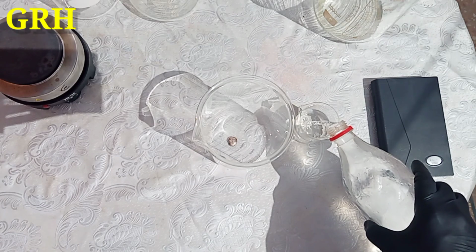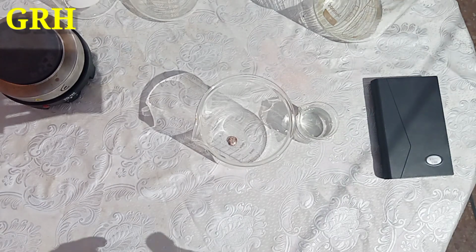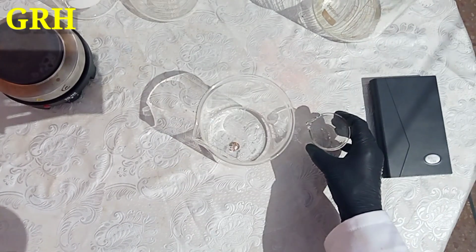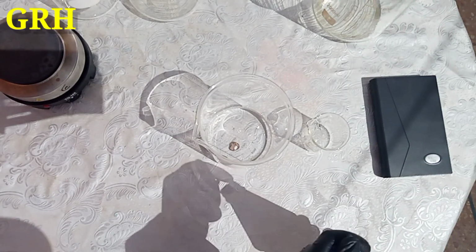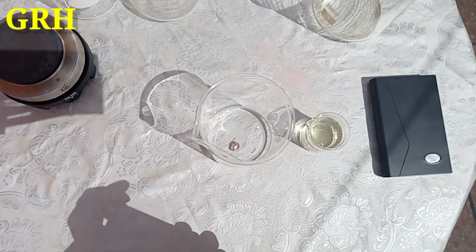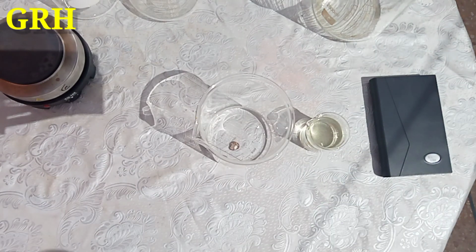Never add water to an acid. If you do, the acid will spit and react violently. Always add the acid to the water, slowly. The chemical dissociation of the ions produces heat, one product of an exothermic reaction.